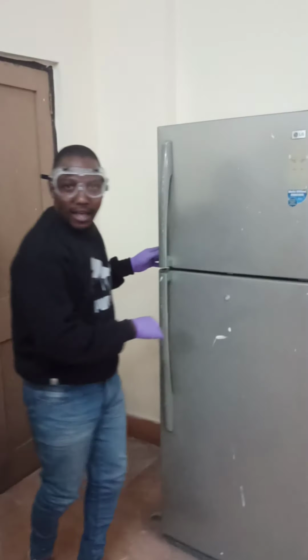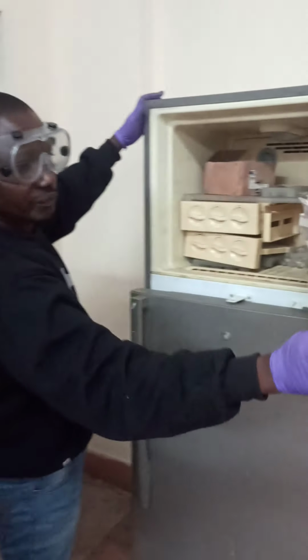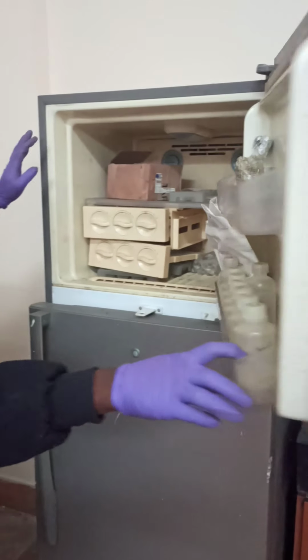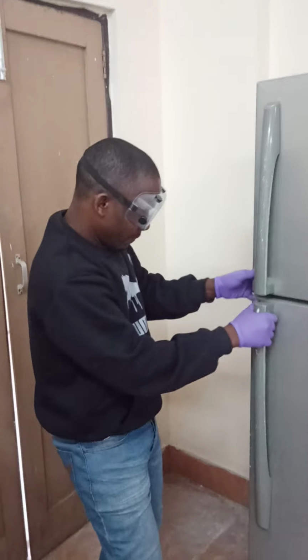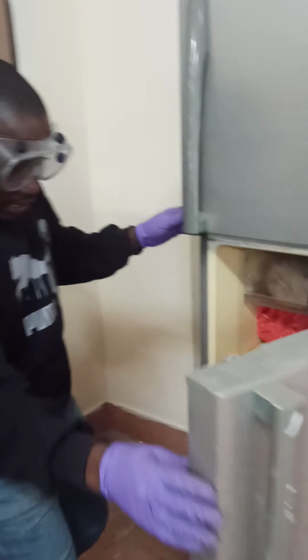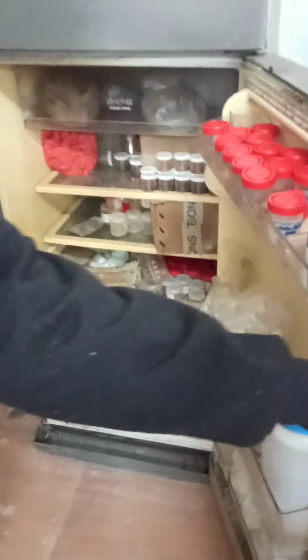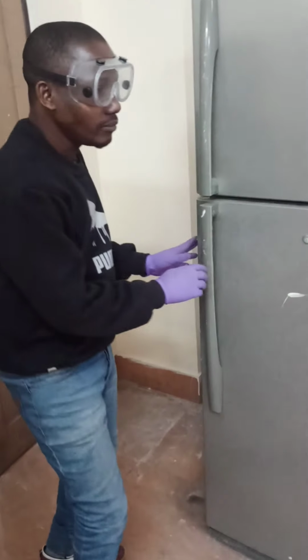I'm having the freezer here. I'll be keeping my samples. They are here. A lot of samples you'll find in my freezer. Here you'll find a lot of my samples. Okay, you can enjoy it. A lot of my samples.